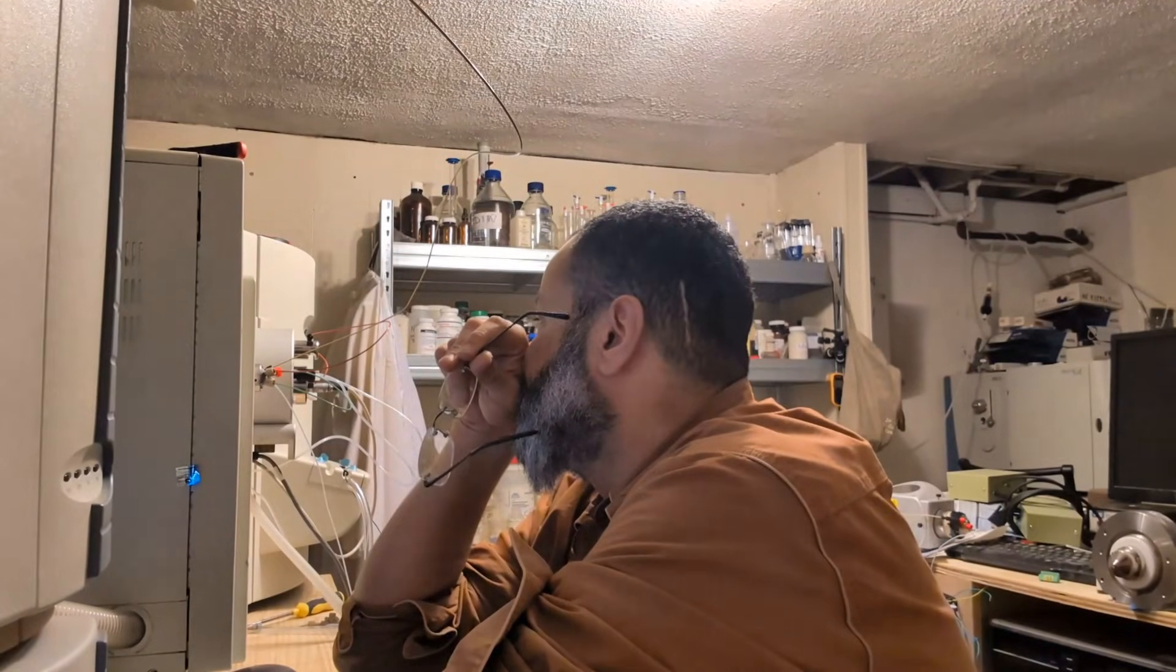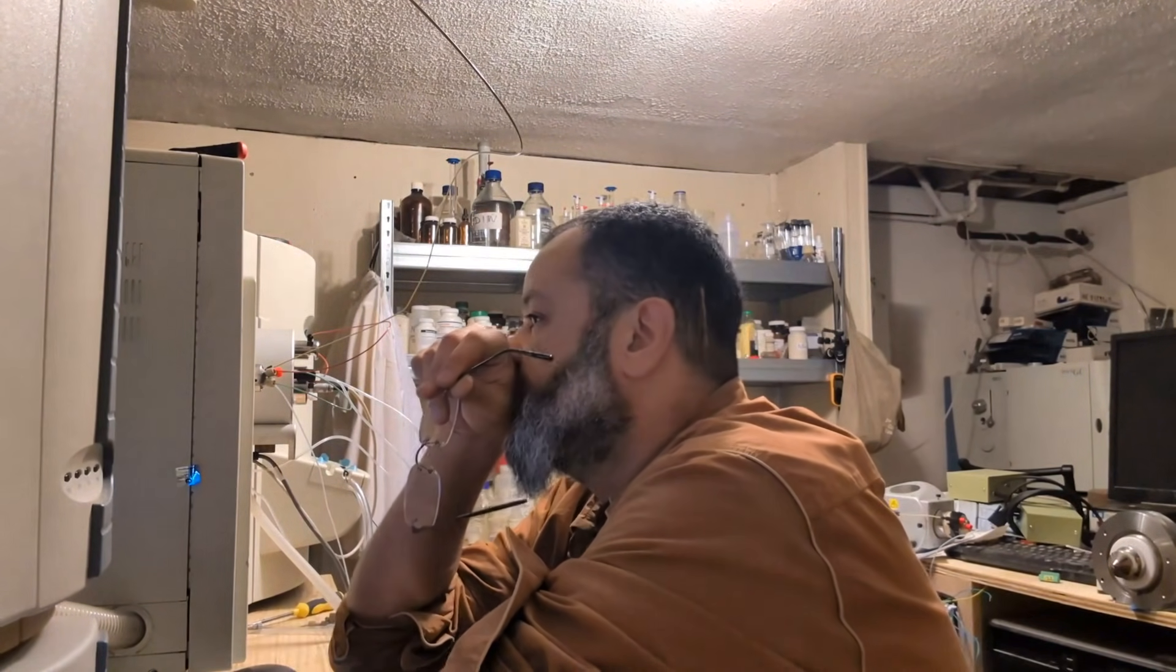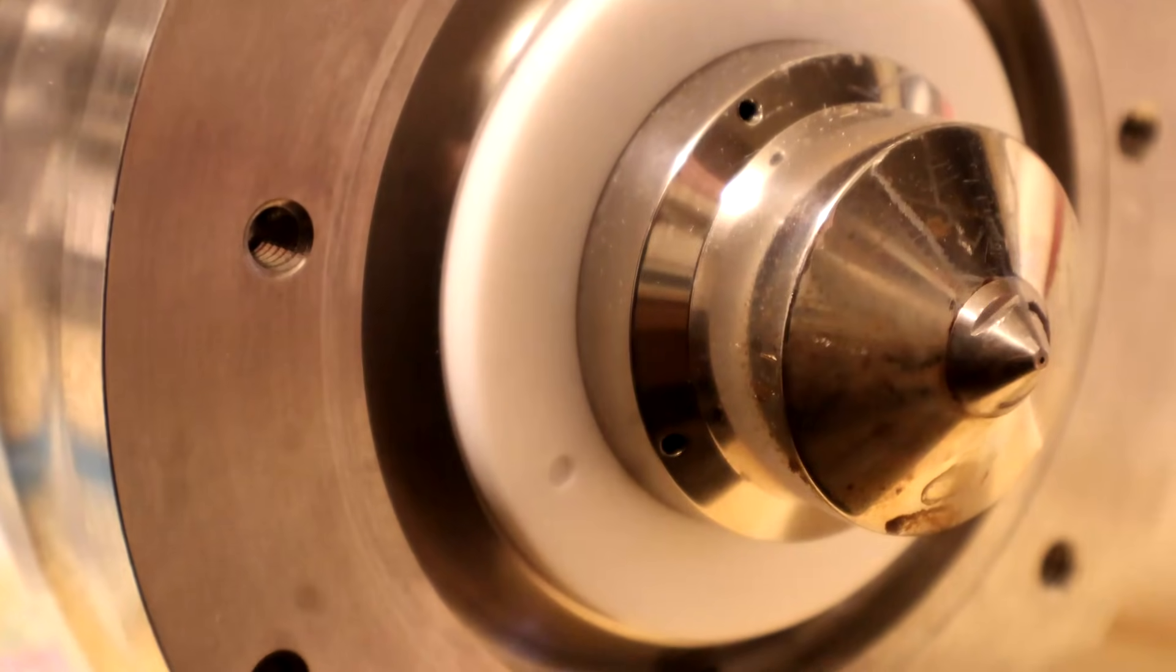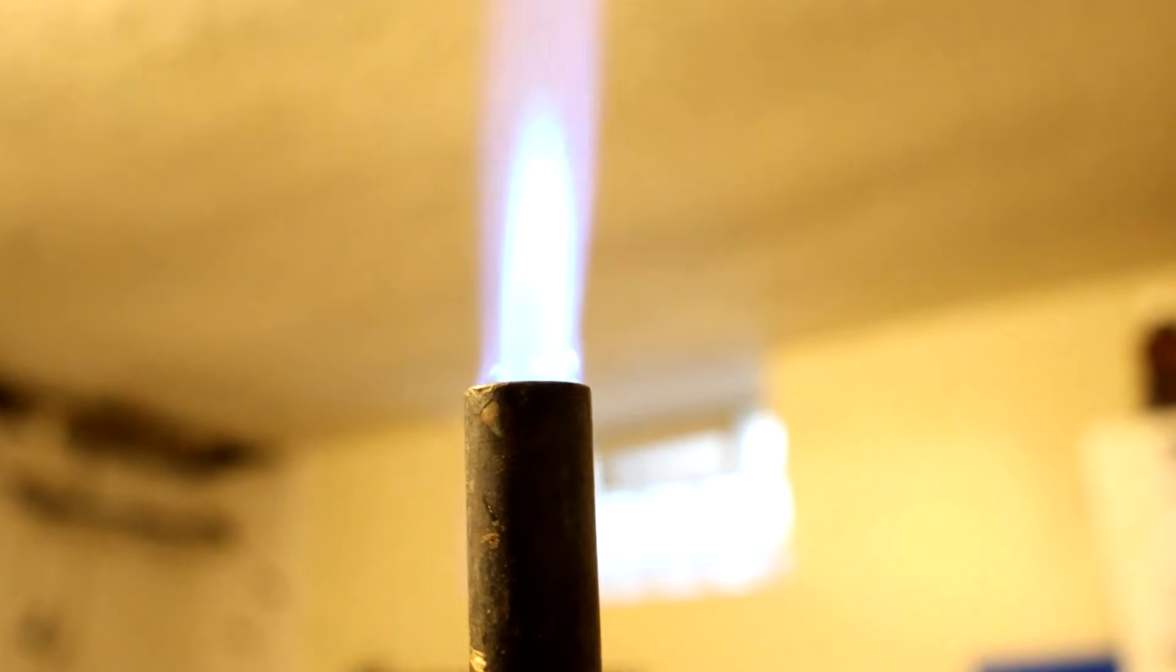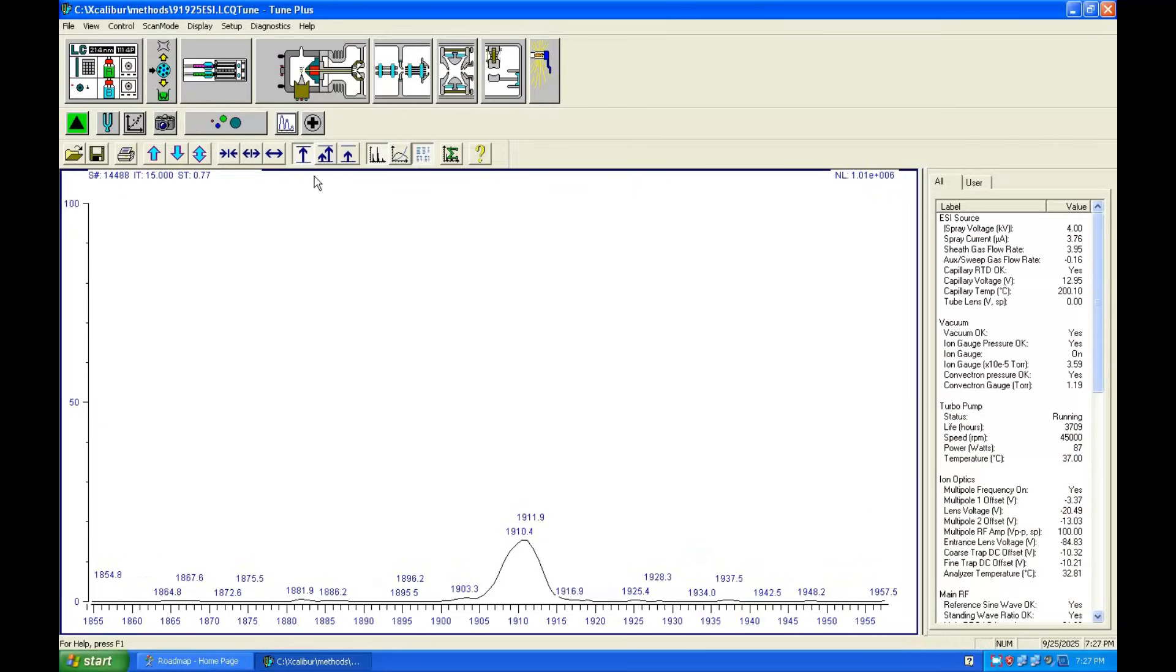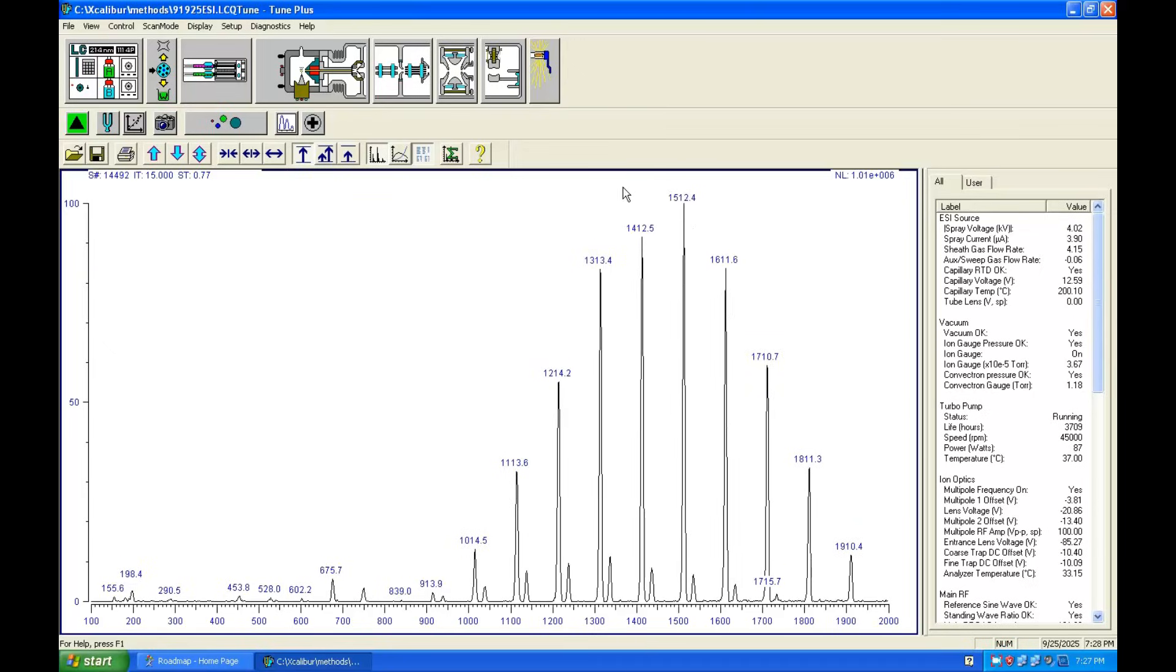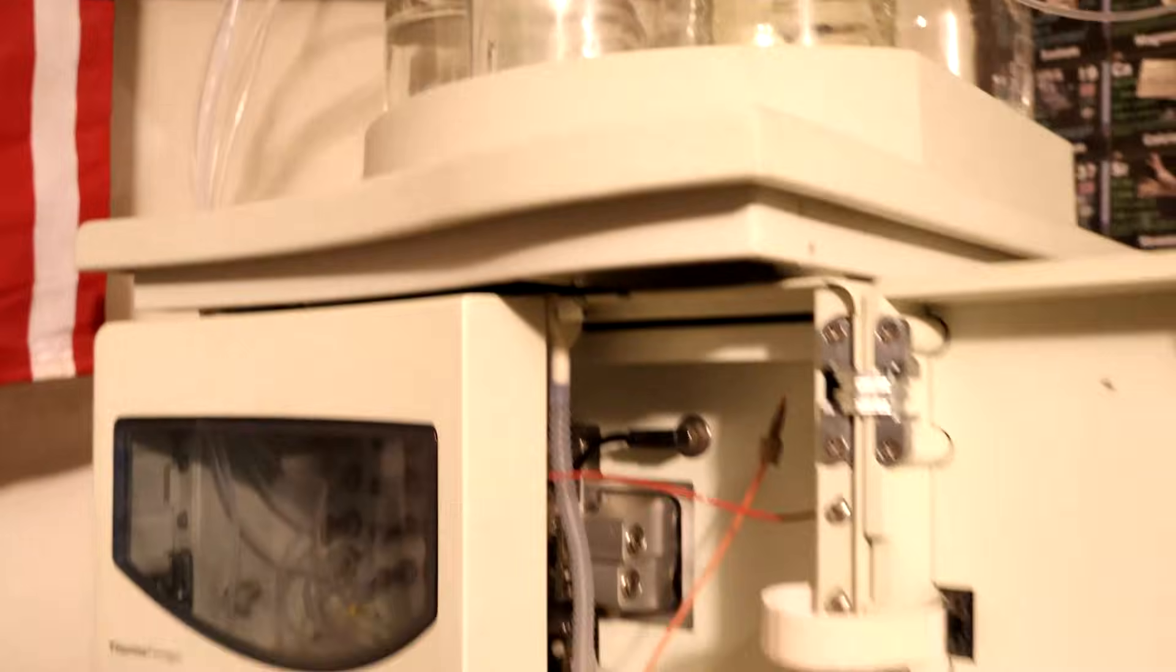As of December 2025, this is where it stands. I thought about turning this whole thing into an ICP-MS but I'm not sure how to keep the skimmer cone cool. A regular propane torch aimed away from the entrance does generate enough ions to be detectable but this is not a reliable steady stream of ions and can't really be used for analytical work. So let me know in the comments what you think I should do with this setup.